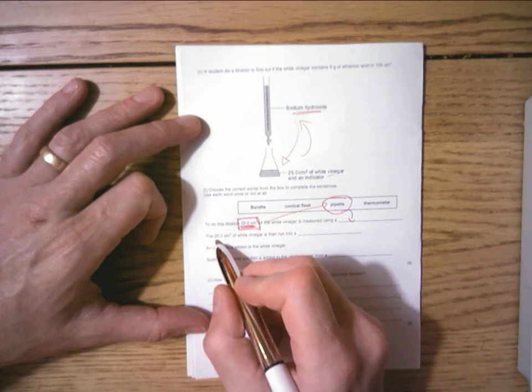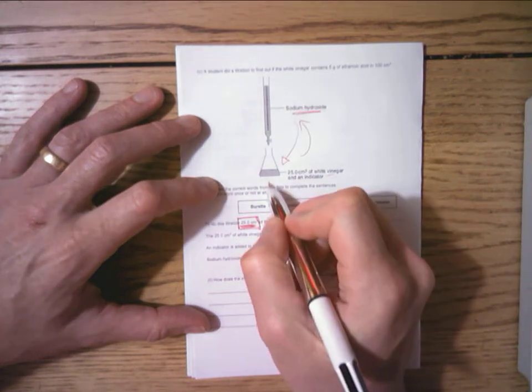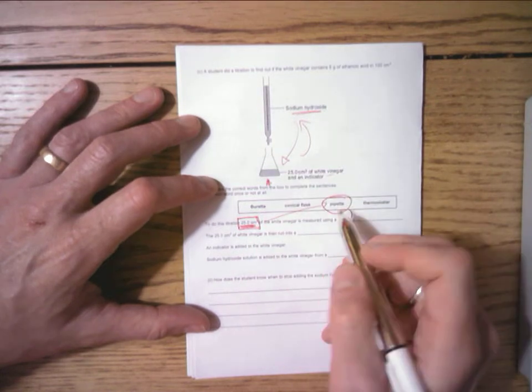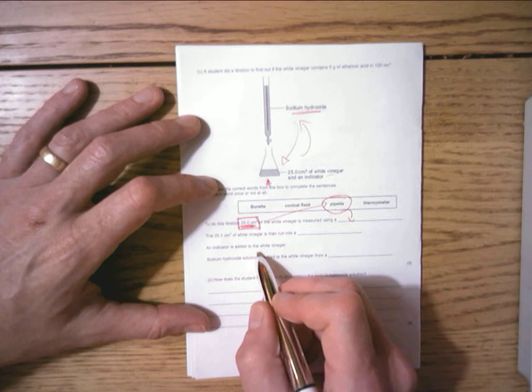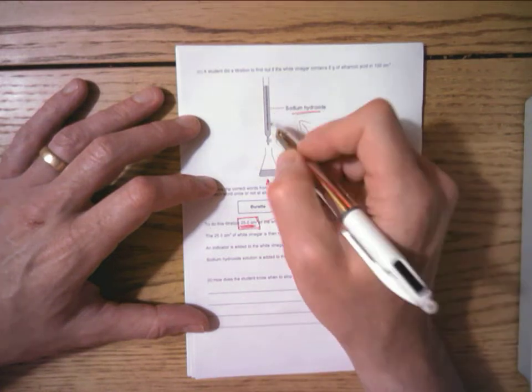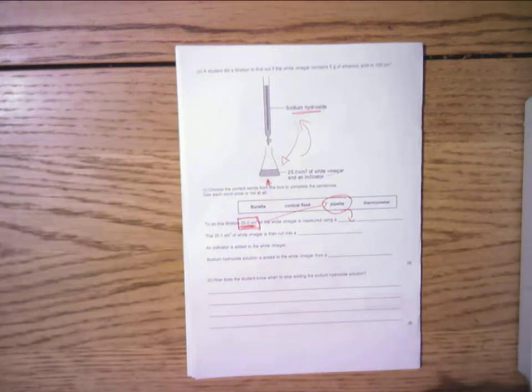We then put the 25 cm cubed of white wine vinegar into there. Look, here it is, it's in there. What's one of those things called? It's a conical flask, isn't it? An indicator is added to the white vinegar. Sodium hydroxide is added to the white vinegar from, what's this thing called with the tap? It's called a burette, isn't it?